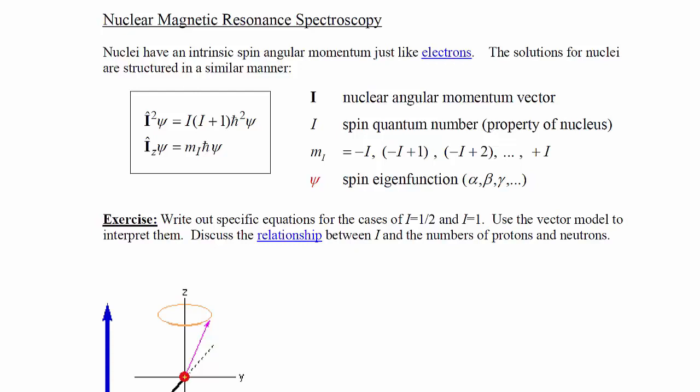So it gives lots of structural information, and we can follow what the electrons are doing because the position, or where the peaks occur in the spectrum, is directly due to what the electrons are doing in the vicinity of the nuclei. It is a nuclear property, though, that we're measuring here.